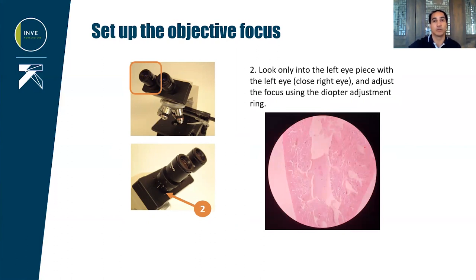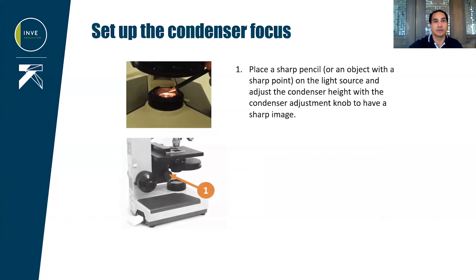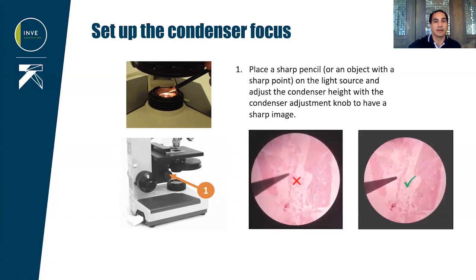The objective is now in focus. You can look with both eyes and make minor adjustments if the image is not completely sharp. We then need to set up the condenser focus. For that, we will place a sharp pencil or any other object with a sharp point on the light source and look into the eyepiece. If the pencil point is not in focus, adjust with the condenser adjustment knob, and when in focus, it is possible to see blue-purple edges around the object.